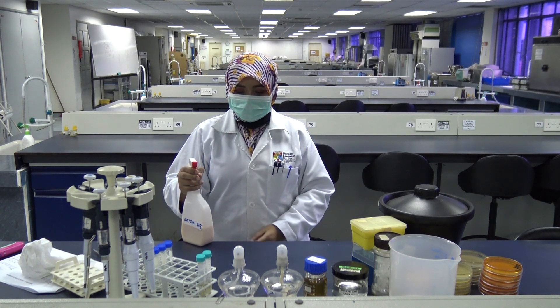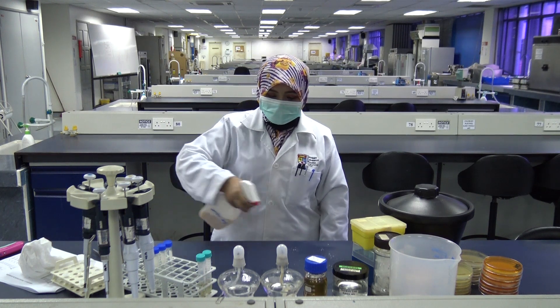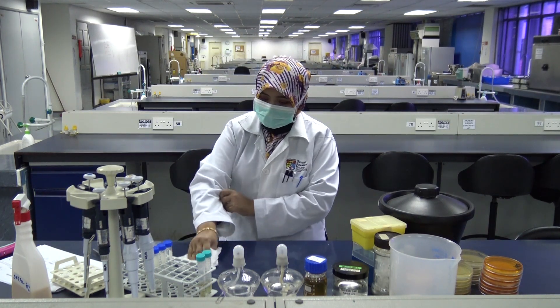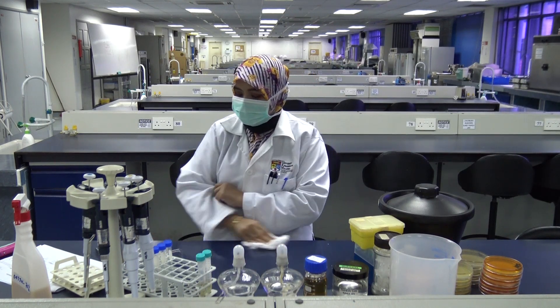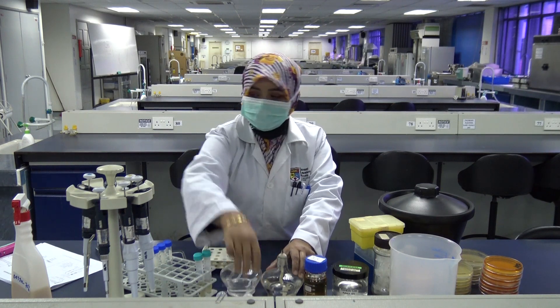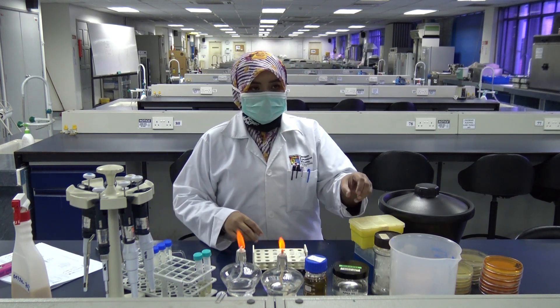Before you do any experiments in the lab, you need to make sure that your bench space is sterile. We do this by spraying Dettol on the area where you want to work, then using tissue to wipe it off. Remember you are working with bacteria, so everything has to be done aseptically — all experiments have to be done around the flame.